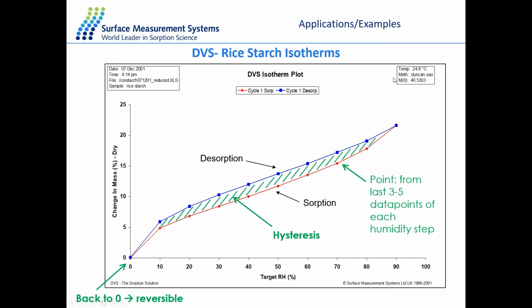This experiment was specifically run at 25 degrees C, which means that if we increase the temperature of the sample, for example, if we repeat exactly this experiment at 30 or 35 degrees C, what we will probably observe is that this gap of hysteresis will reduce progressively, because we are providing more energy to the molecules of water and consequently also drying the sample much quicker.